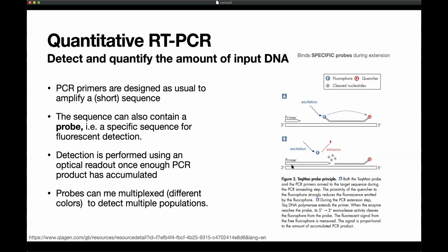Now what happens here is that once the primer gets to where the probe is, it cleaves off the probe. The probe is now free to float away from the quencher. And when you have the right wavelength of light coming in, you'll have detectable emission. And again, the reason for this happening is you actually want to see active elongation. So not only did you have binding, but you also had a successful primer attachment, and this was being actively extended by the polymerases.